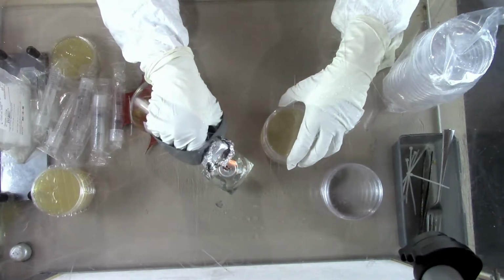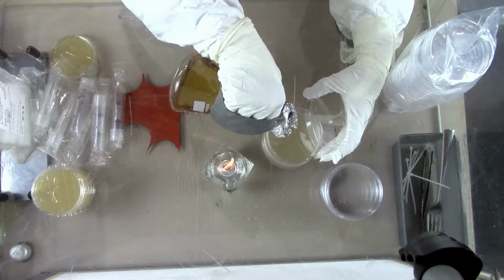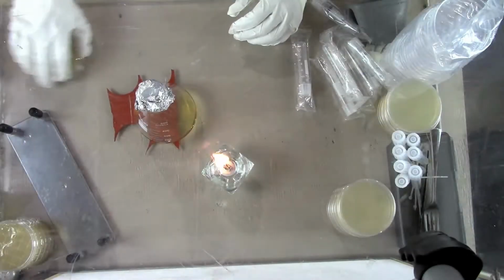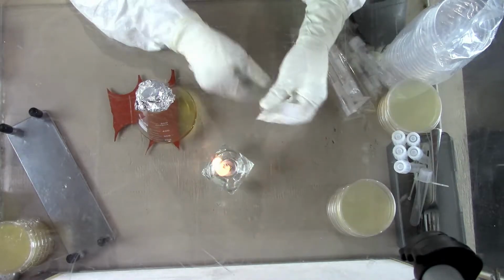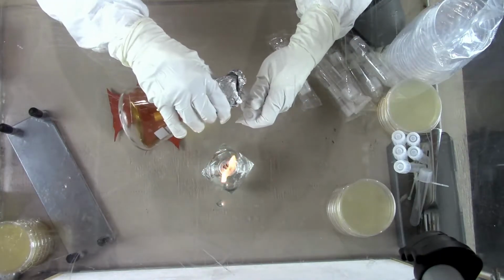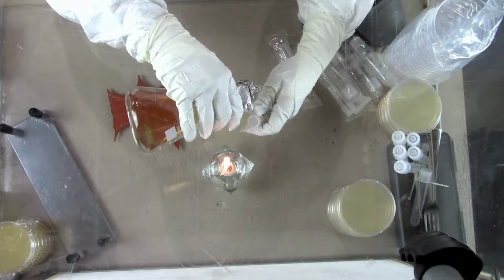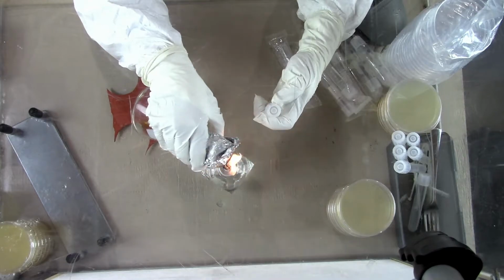So again, I stack them in like 3 or 4, and every time that you pour, you must go through the flames. Now for the slanted tubes, the same principles apply. In this case, these are sterile plastic tubes, so you don't have to flame those. You just flame the Erlenmeyer or shake flask, pour 5 to 6 mils in there, and always flame the shake flask.